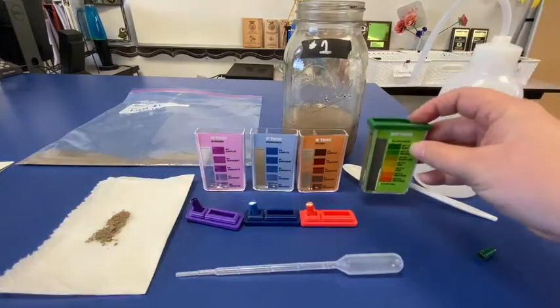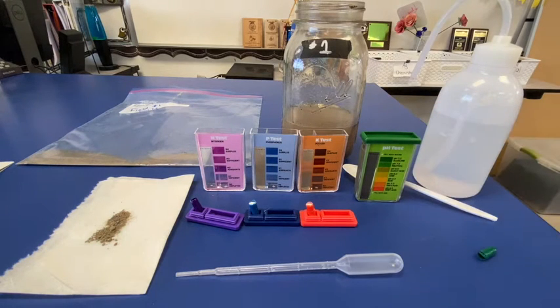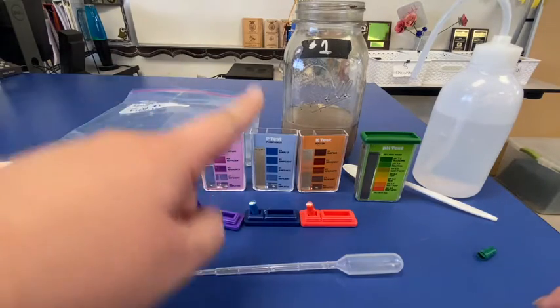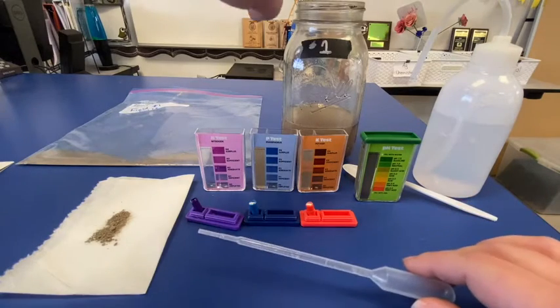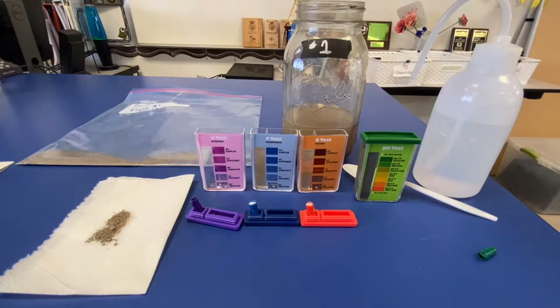Perfect. So once I have that, I'm going to set it to the side because we're done doing this pH test. In about one minute or so, I will then check the pH. For the time being, I'm going to show us how we can do our nitrogen, phosphorus, and potassium or potash test. We have our profile. I'm going to use my pipette, and I want to make sure I'm getting the liquid — that water portion.